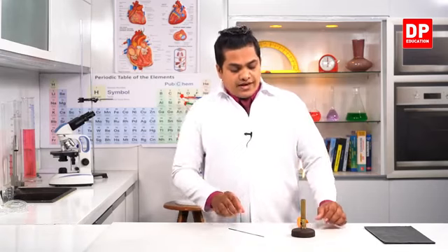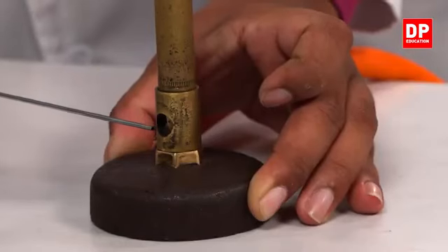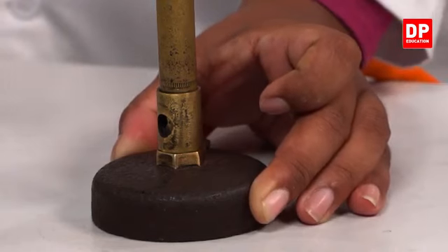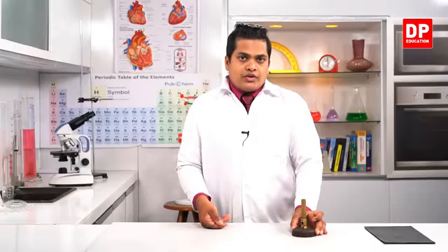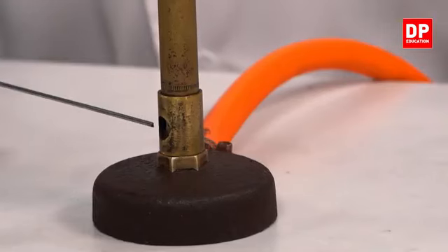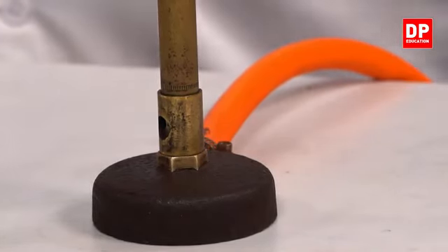It's because there is an air pore here. It allows oxygen gas to flow into the Bunsen burner. You know that to burn any kind of fuel, we need oxygen. So this is the entrance where oxygen gas enters the Bunsen burner.